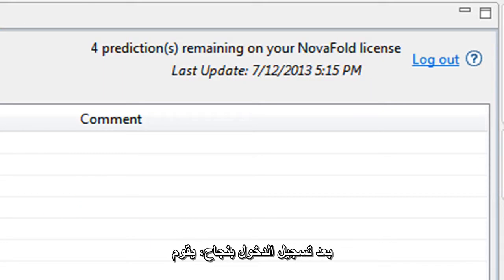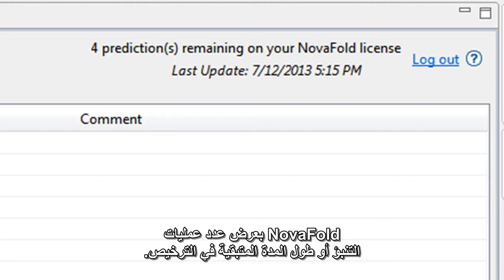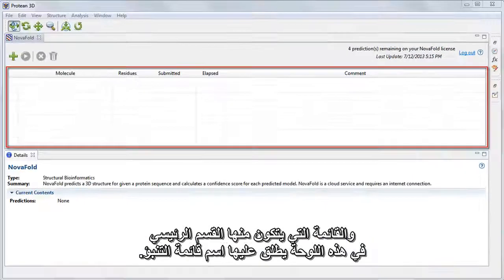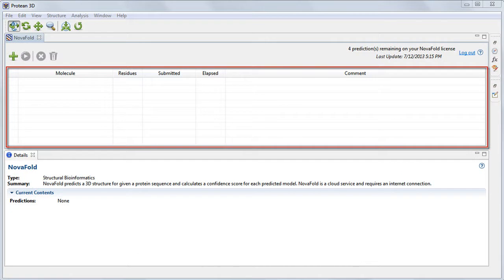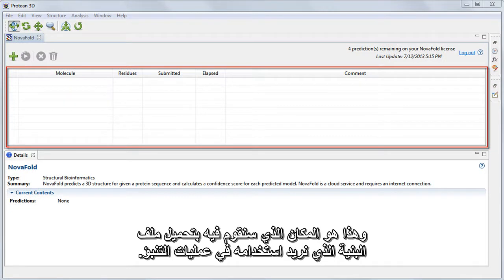After successfully logging in, NovaFold shows the number of predictions, or length of time, remaining on the license. The table that makes up the main portion of this panel is called the Prediction List. This is where we'll load in the structure file that we want to use for our predictions.